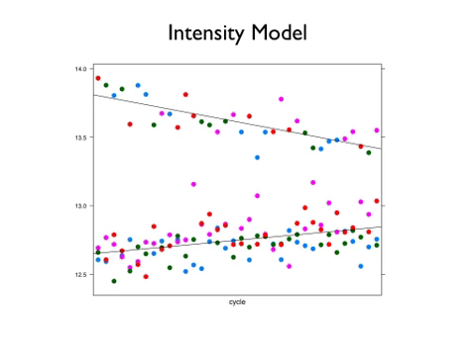So here's the idea. We're just looking at data. We can see that if you plot, this is for one read, you plot intensity versus cycle, now in the log scale. You'll see the problem. The intensity for the signal, right? So why are there two groups? First of all, if you're with me. So there's all the colors plotted. Why are there two groups? What are those? These are the real ones and these are the wrong ones, right? But you still get intensities for everything.